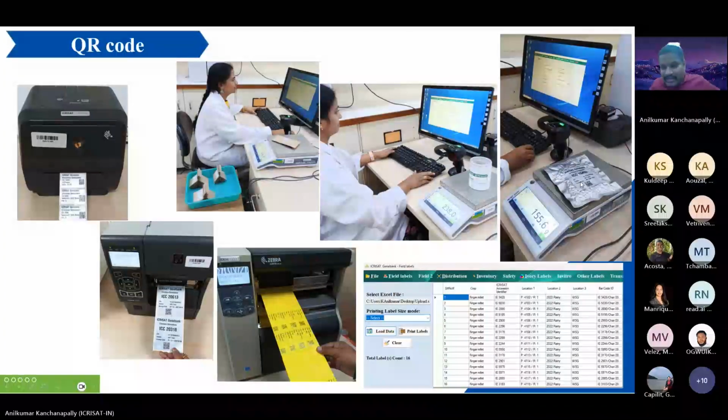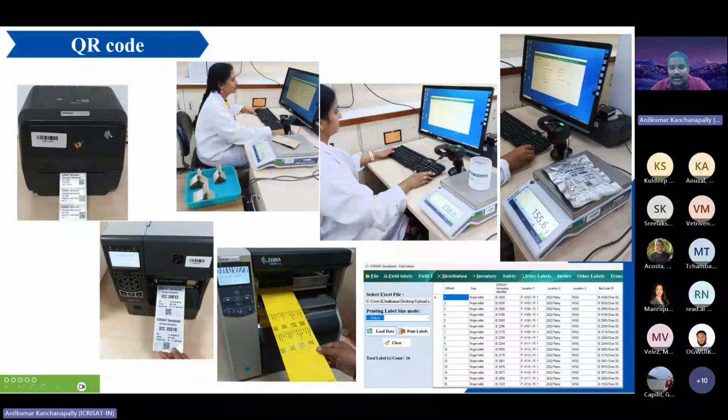And here this bottle as well as this packet is related to MTS. If you see this aluminum foil packet, this is an LTS packet. Almost groundnut and sorghum crops are barcoded in LTS, and 100% of MTS bottles are barcoded. And here you can see barcode labels printing for the LTS. This ICC is a chickpea accession, and this yellow one is a field use label.